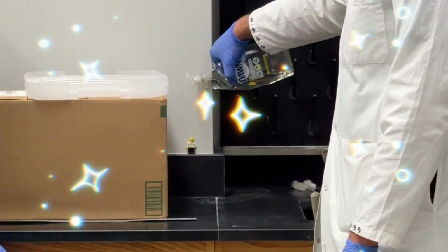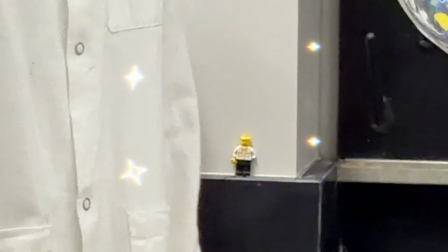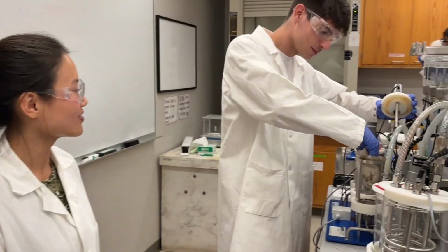Do not miss any measurements during all these trials, or you will have to start over and it will not be good. We slaying it, never quit. Slaying it with the grit. One error we had was having dye in one of the trials. Don't do this. Keep it consistent through all of them. This lab is very time consuming, so be very quick with changeovers.